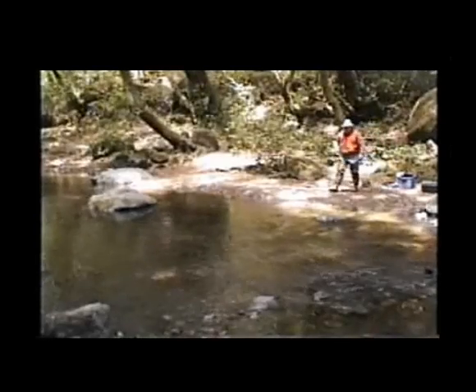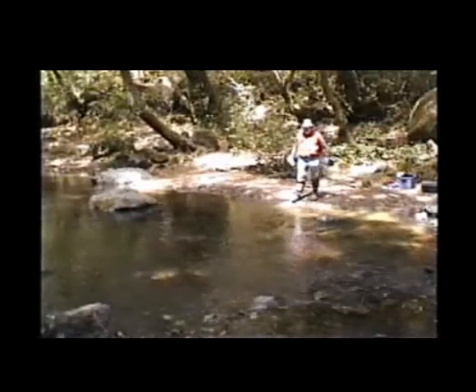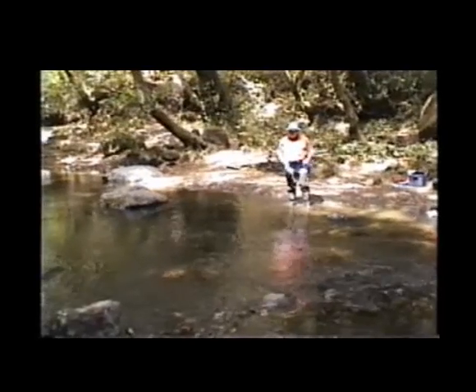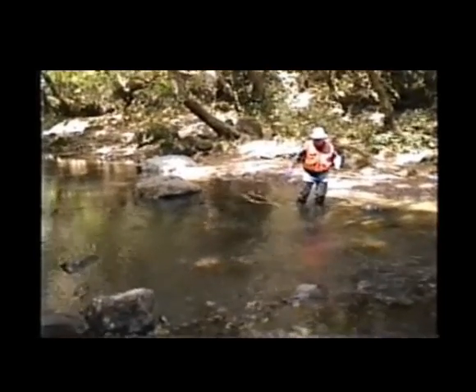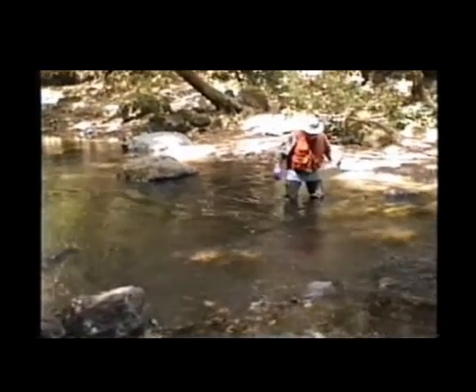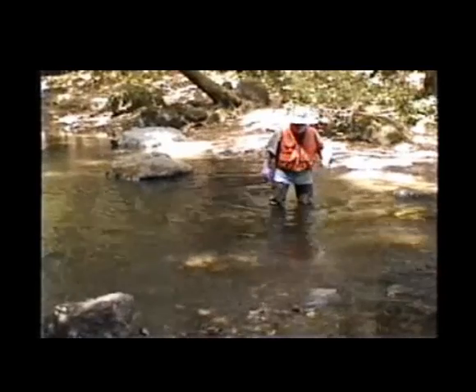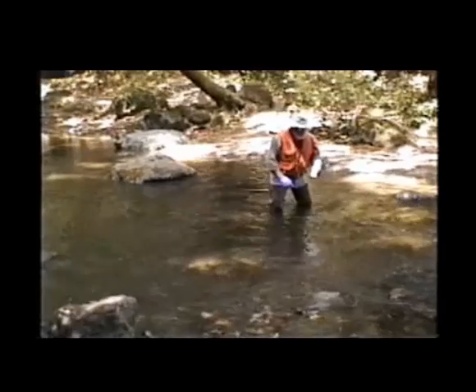An inorganics sample is now going to be collected. The sampler is looking for the centroid of the stream, usually somewhere in the center or where the deepest channel or the thalweg is located. You can also tell by the flow of the water. You want to get a representative sample of the whole stream, usually in the center, or the centroid is the best place.